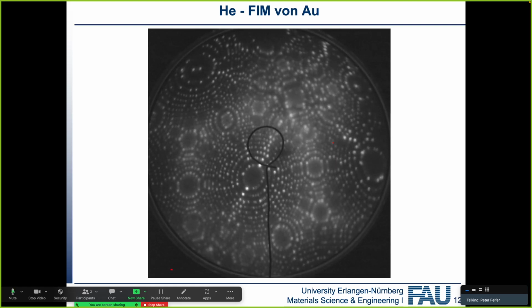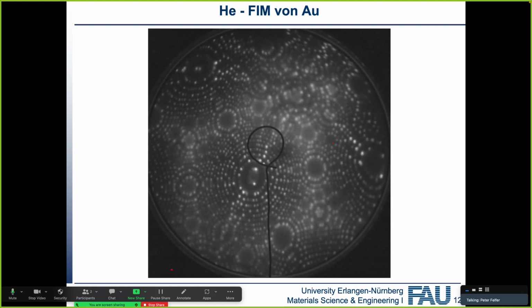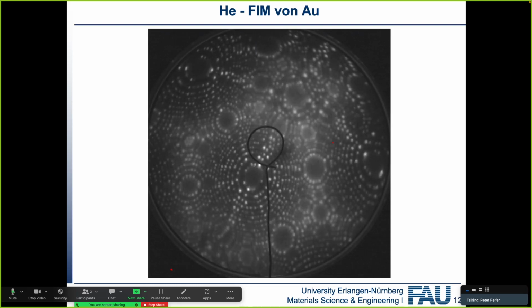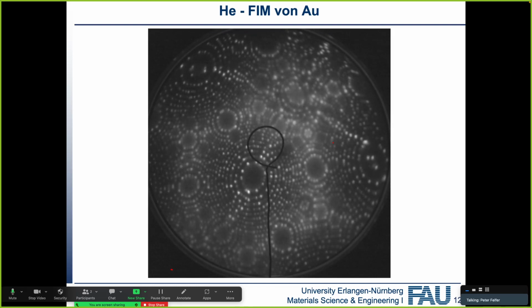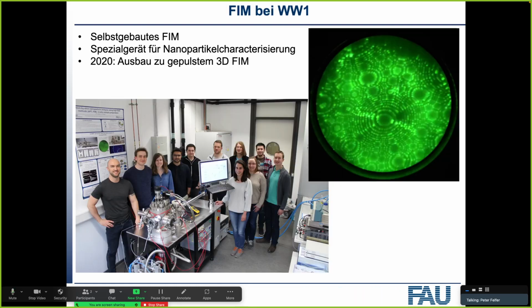It starts at a very distinct voltage, which means this is a very controlled process, because if you decrease the evaporation barrier, eventually it will be overcome, and this is a very distinct point. But you're going to be able to do that hopefully yourself after Christmas.